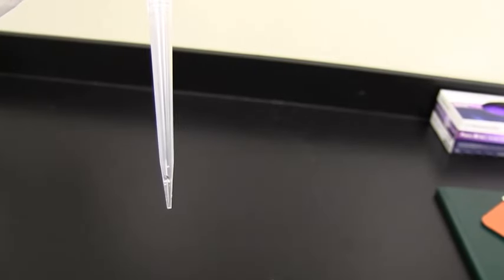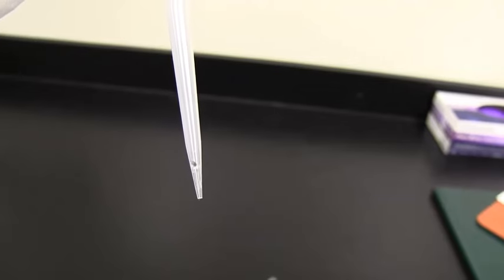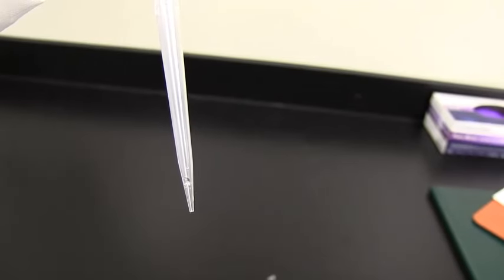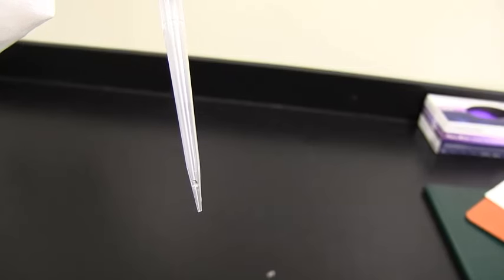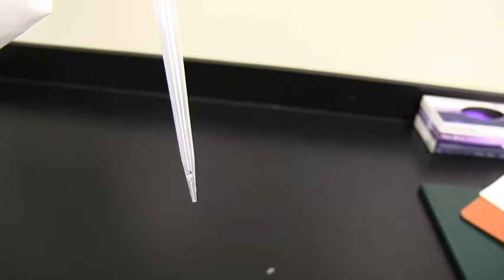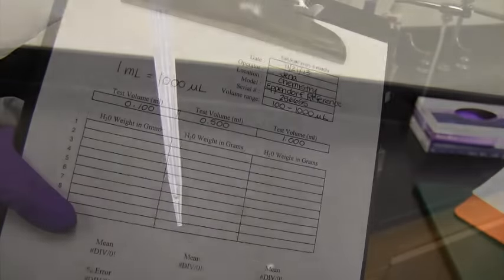So after we've dispensed the water out of the pipette, sometimes there's a little bit left over. And this is volume that's actually still left in here. So if we try to get another 500 microliters, it's actually going to be a little bit more than 500 microliters as this water is still stuck in here. So when this happens, we'll just take a new tip.